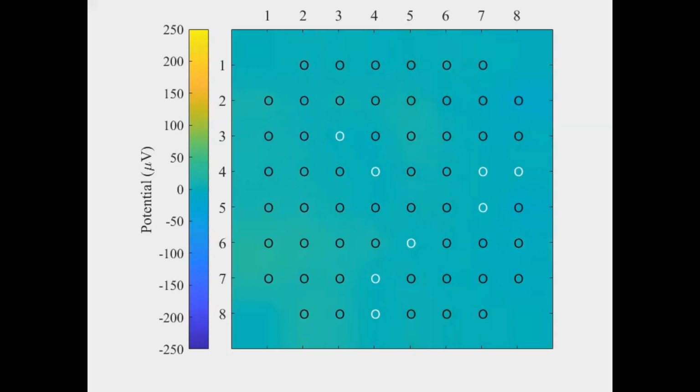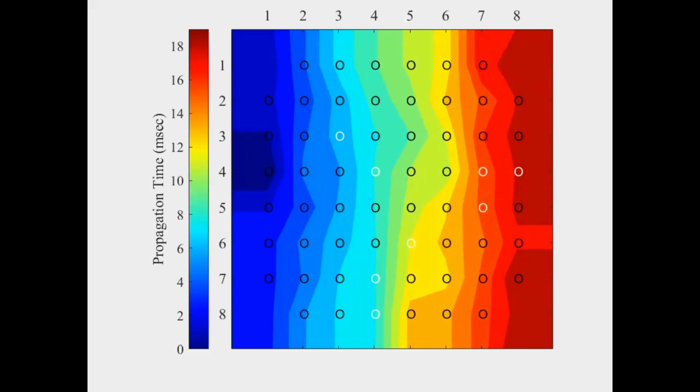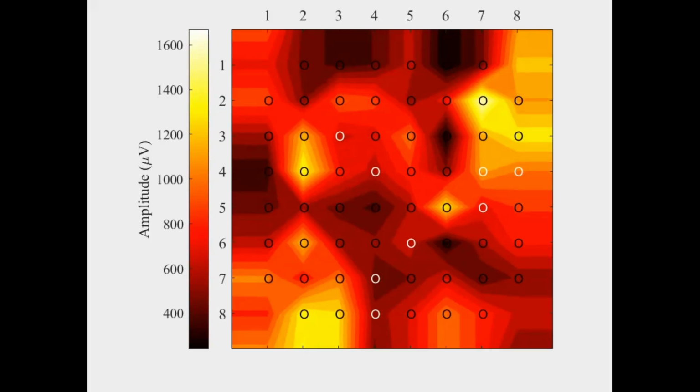For example, the potential, signal propagation, FPD, and AMP videos. But that's not all.